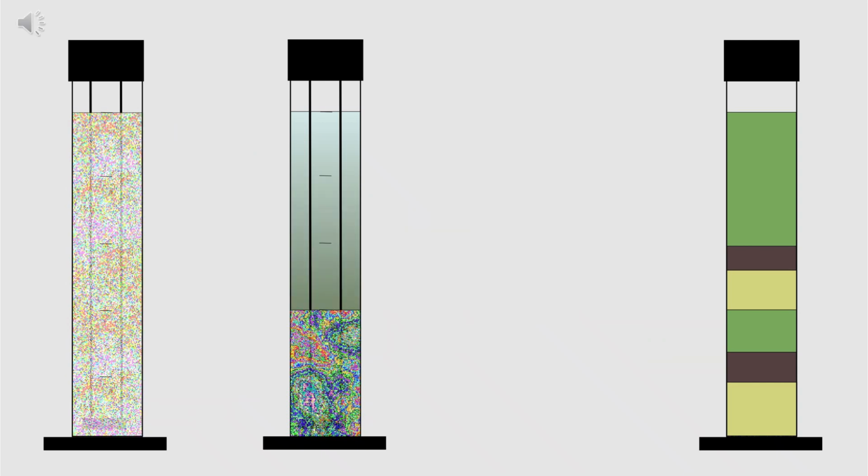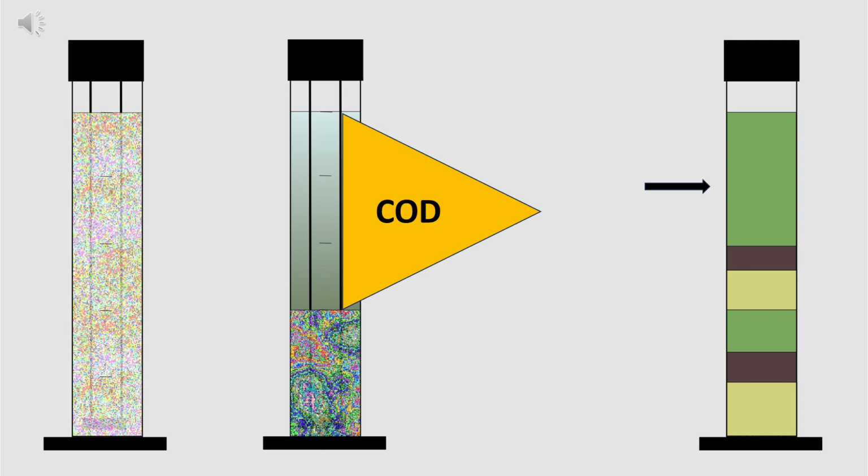Letting the sample settle, a COD measurement of the supernatant will give the sum of the fractions, biodegradable soluble and inert suspended, which may be a more accurate estimate of the BOD equivalent expected from a BOD5 analysis.